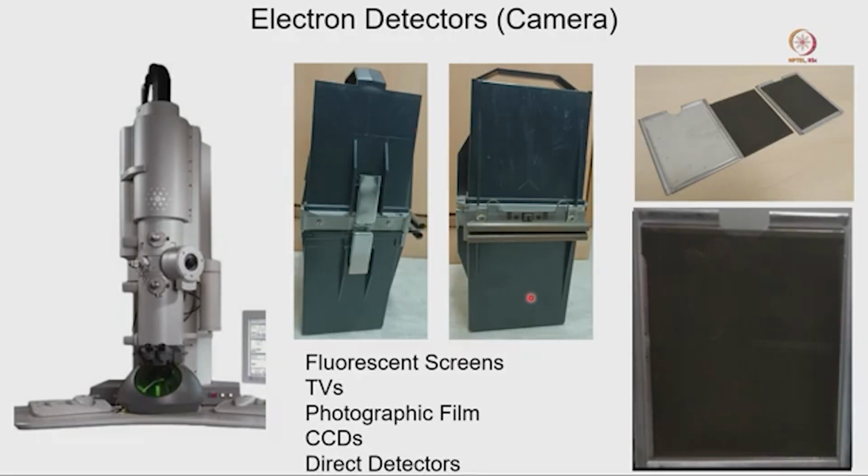Most of the time for cryo imaging we are using an extremely low dose, and if you remember I told you that we have to use only 40 to 80 electrons per angstrom square, and that is the reason we use a higher spot size, fixed intensity and the aperture to reduce the electron dose. And when the electron dose is very low, our photographic film should be very sensitive to record the data. If it is not very sensitive, it will be very difficult.